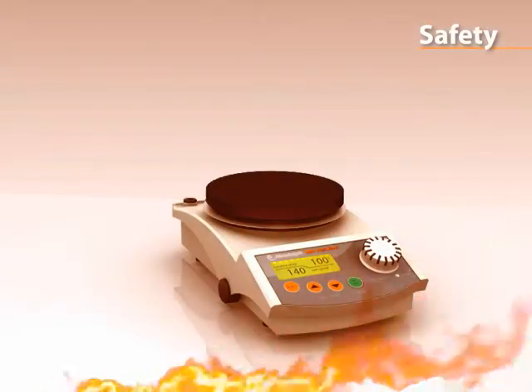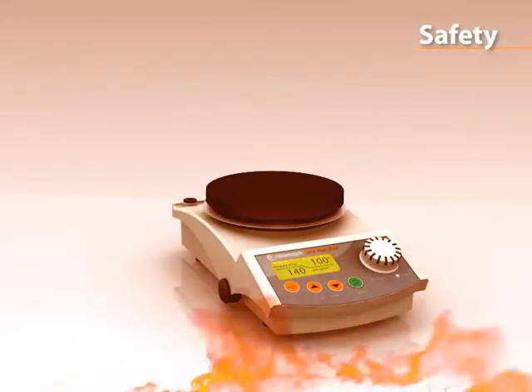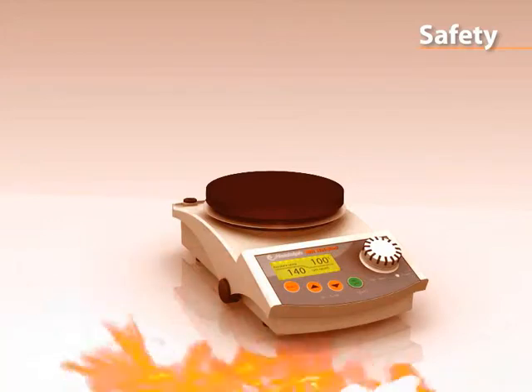Thermal damage to the stirrer is impossible. All models come with a fire-resistant aluminium die-cast housing.